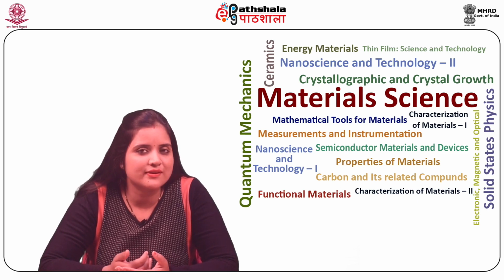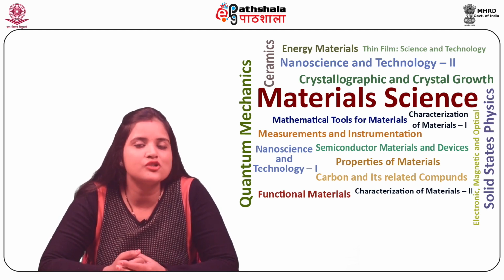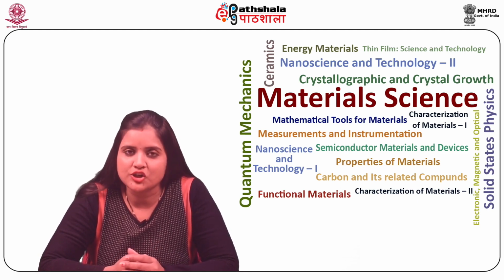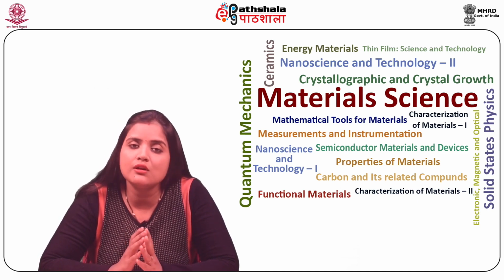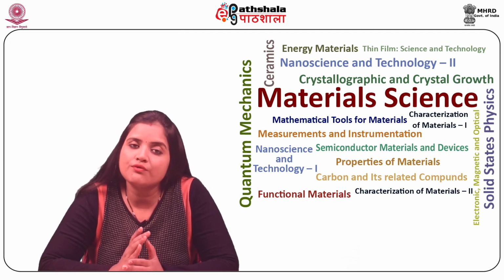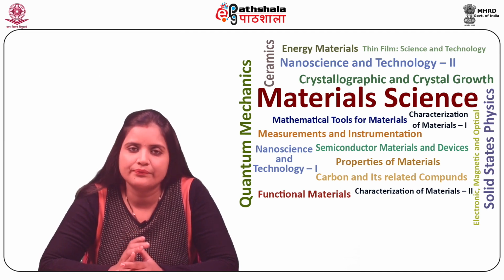Let us now discuss the applications of scanning near-field optical microscopy. The most important application of scanning near-field optical microscopy is in the study of single molecules. Here, usually the fluorescence of a single molecule is detected.